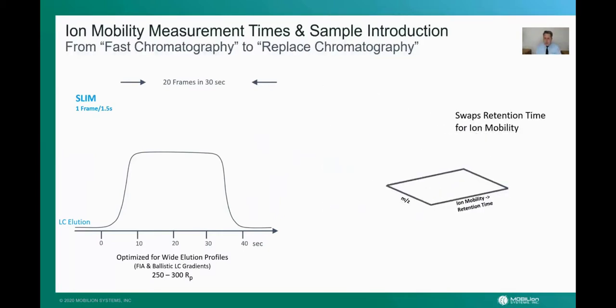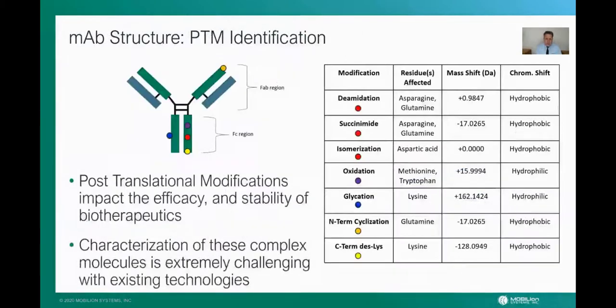And if we wish, we can remap that mobility and plot it as retention time. That way we can use existing QTOF data analysis packages and existing workflows, through any informatics that a person would want to do in that regard. So let's take some examples of that.